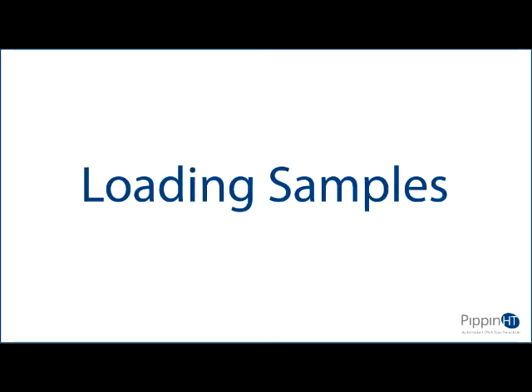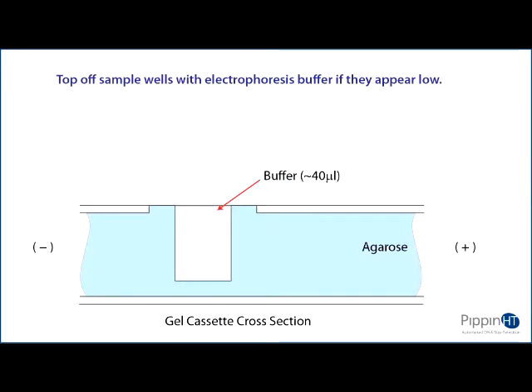Loading samples. Recheck the buffer level in the sample wells. Make sure that the sample wells are completely full to the top with electrophoresis buffer. Top off with additional buffer if necessary.